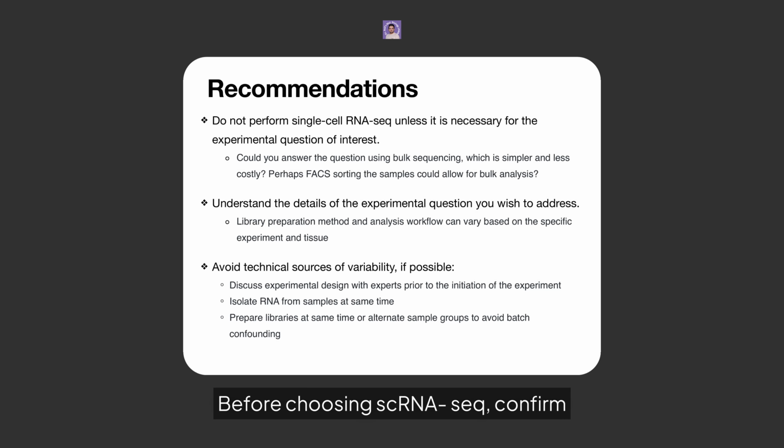Before choosing single-cell RNA seq, confirm it is necessary for your question. Bulk or sorted bulk may suffice. Understand your experimental goals and how they affect library prep and analysis. Design experiments to minimize technical variability, for example, by processing samples and libraries in parallel.